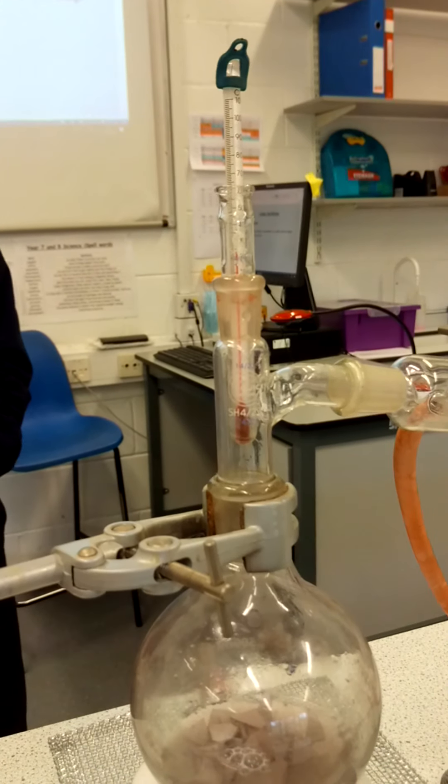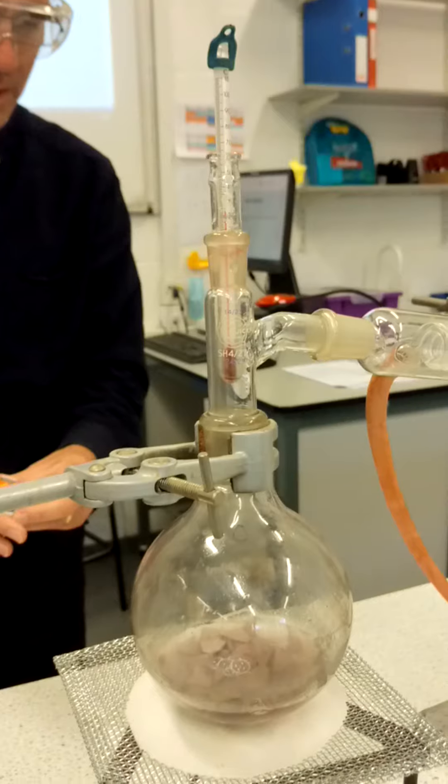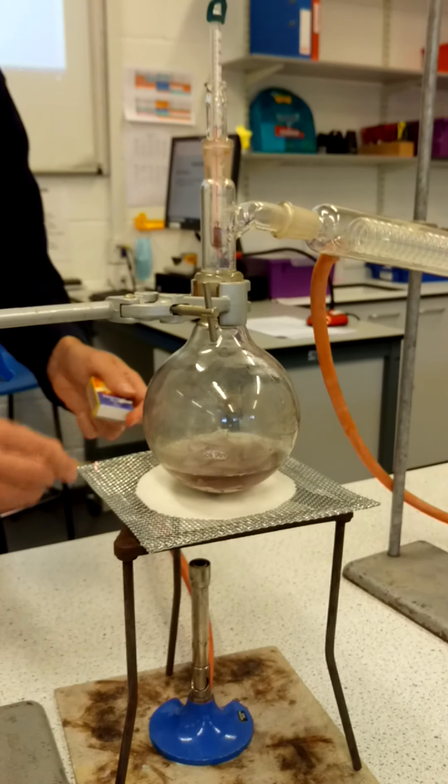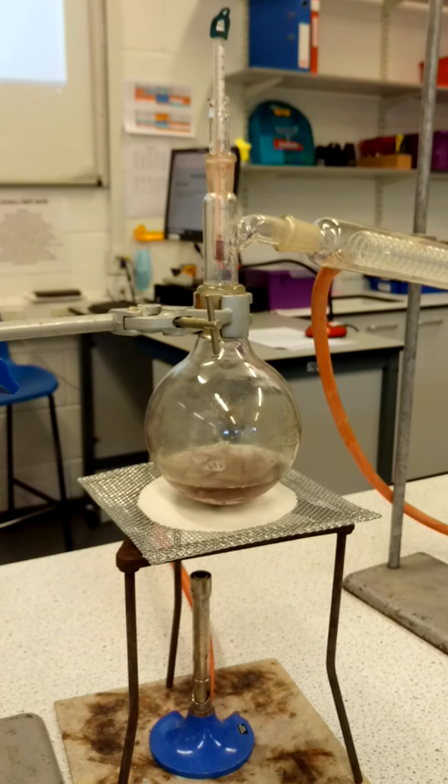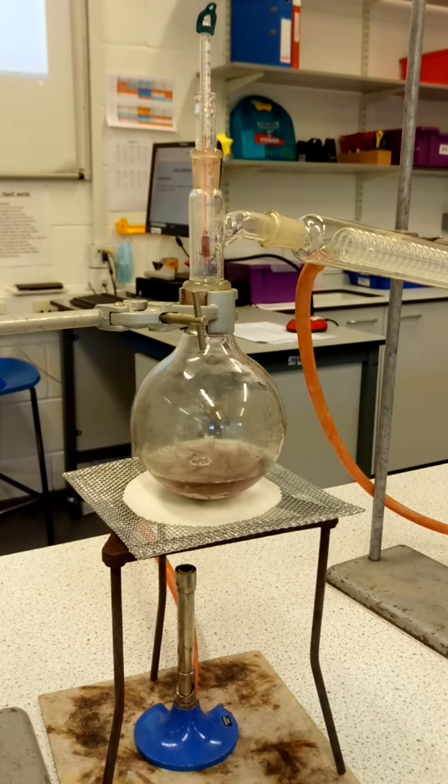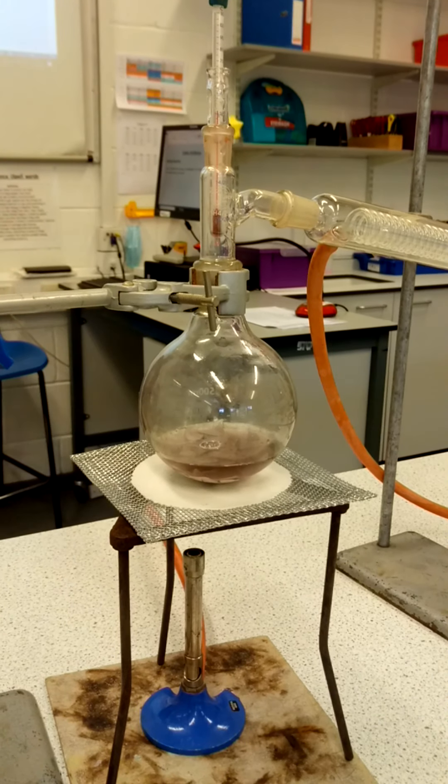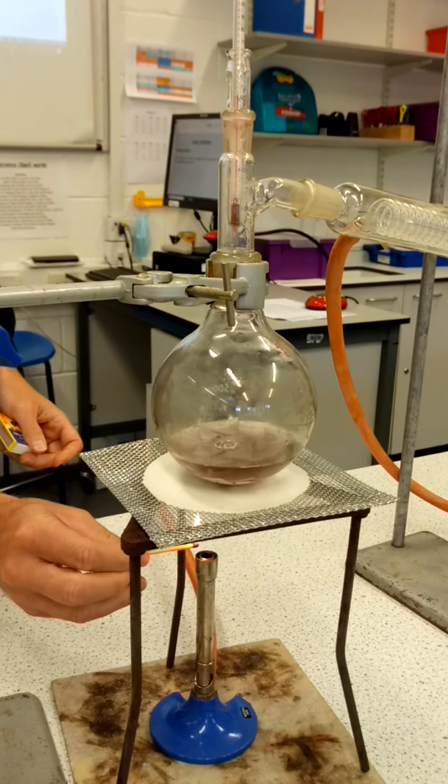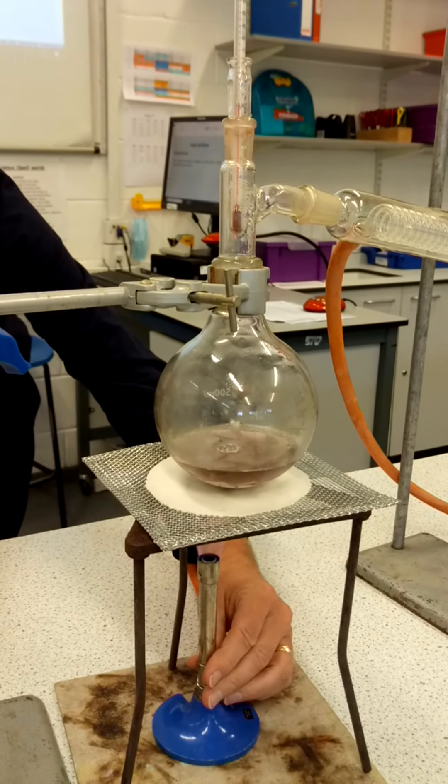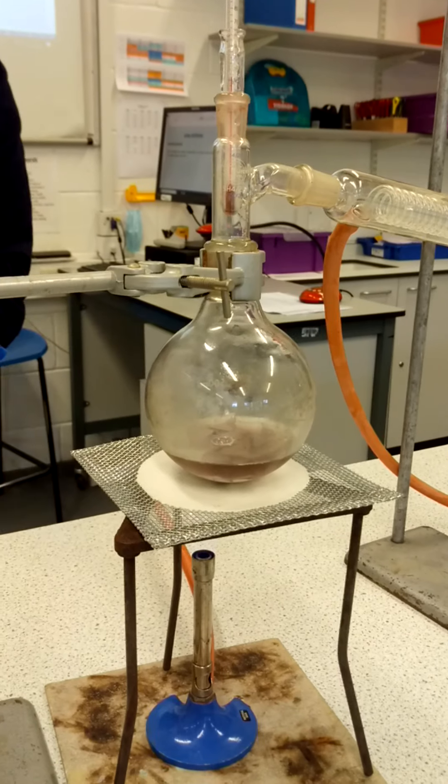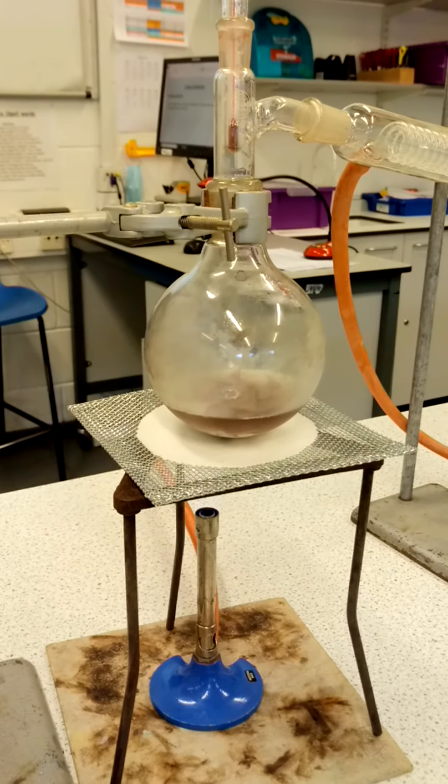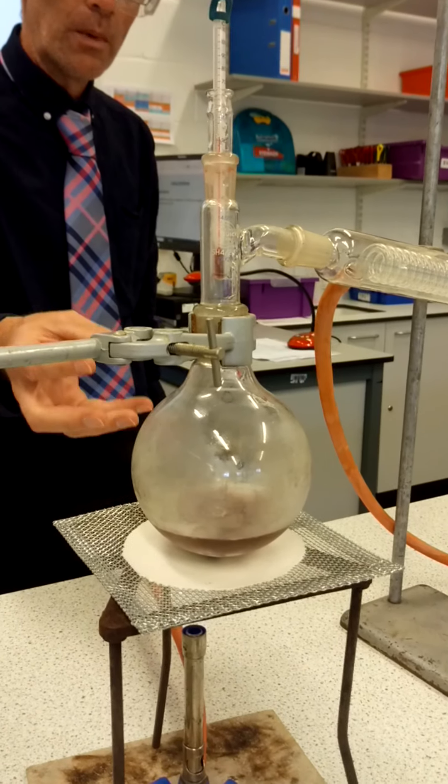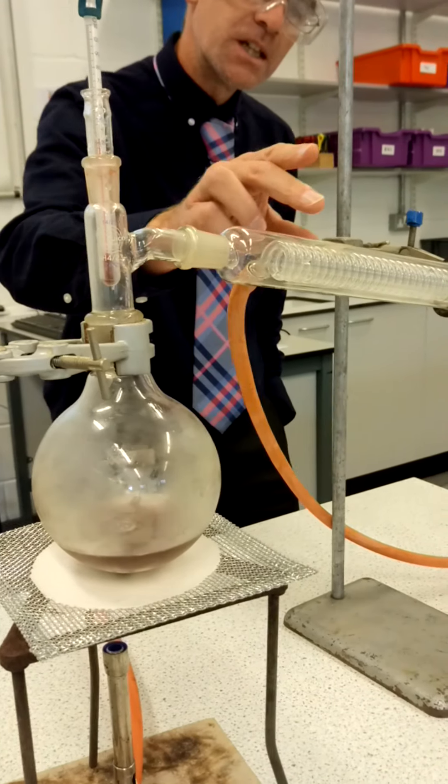And I'm going to ignite the Bunsen and get that going because it will take a couple of minutes. And so what's going to start to happen here in the flask is that the mixture is going to warm up. Now, this is the Liebig condenser.